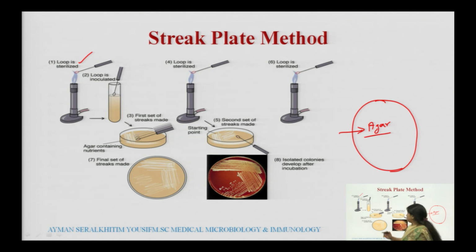That culture is known as a mixed culture. In the test tube we always have mixed cultures. That mixed culture may be a water sample, tap water, a saliva sample, a blood sample, a soil sample, maybe an air sample. So, a mixed culture will contain a number of microorganisms.